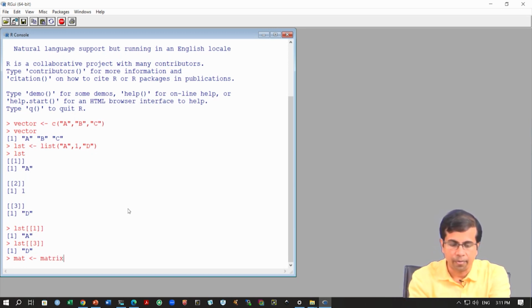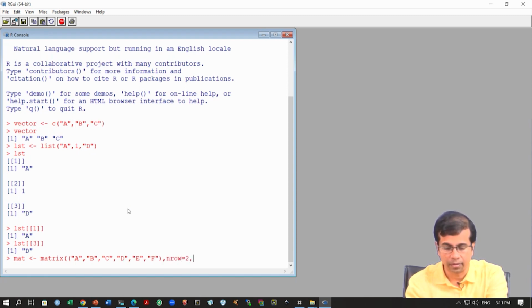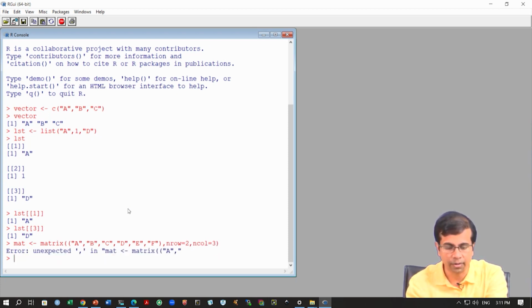So, you can say matrix or as.matrix. So, you can have, let us say, we have to mention how we want to distribute this.